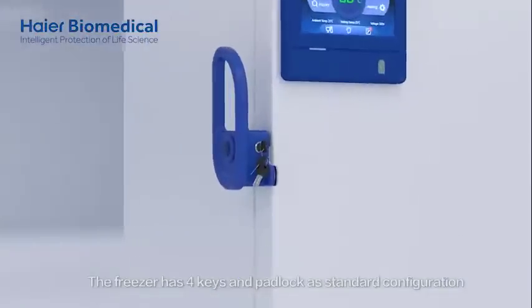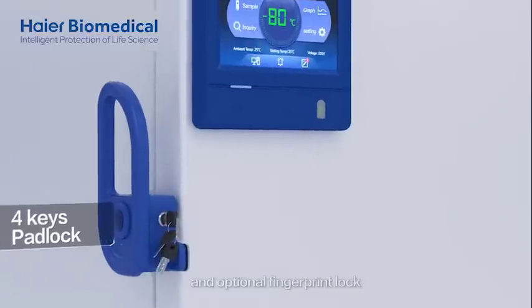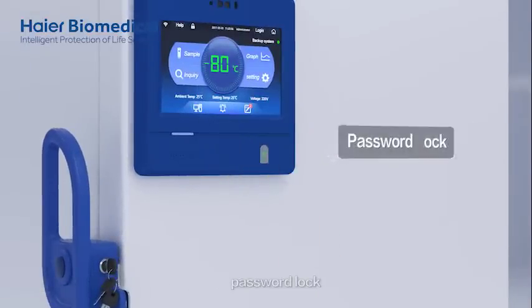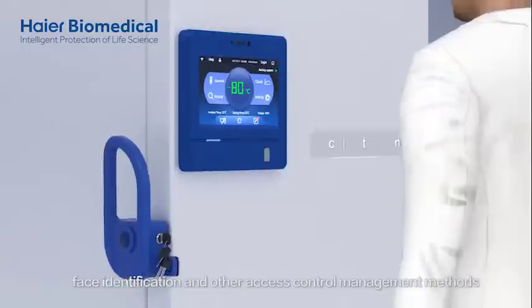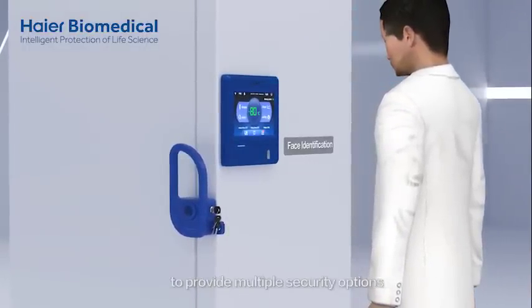The freezer has 4 keys and a padlock as standard configuration, with optional fingerprint lock, card punching lock, password lock, and face identification — providing multiple security access control management options.